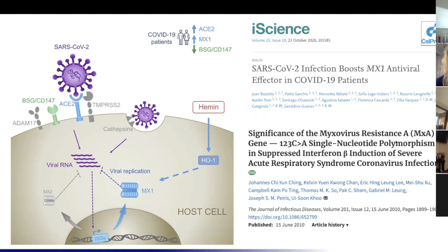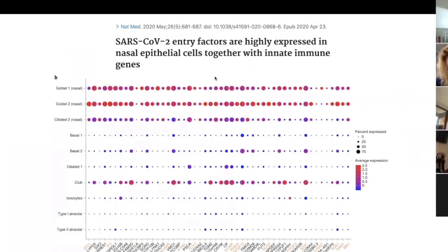So that's gorgeous. What I'm saying is this could be a very good biomarker to determine if somebody's infected. Not only that, but I recently found this paper. What they did was they basically took ACE2, which we looked at, and in healthy tissue, they found the 50 most correlated genes to ACE2. So if ACE2 was high, these genes were high. If ACE2 was low, these genes were low.